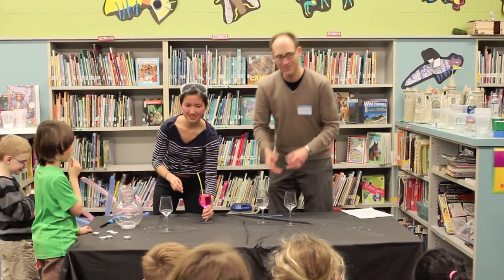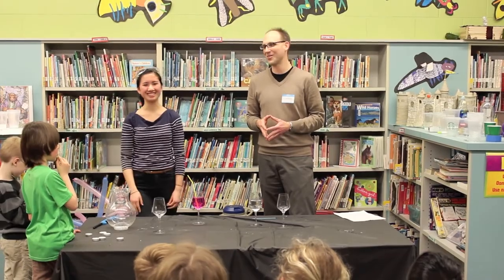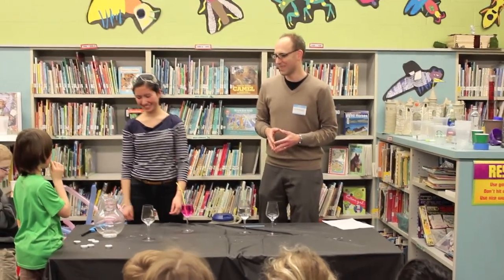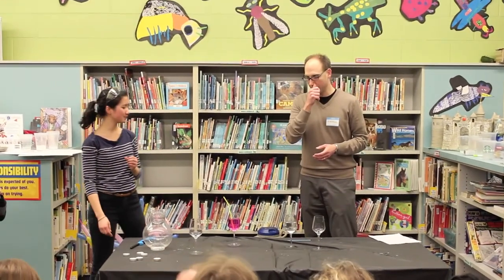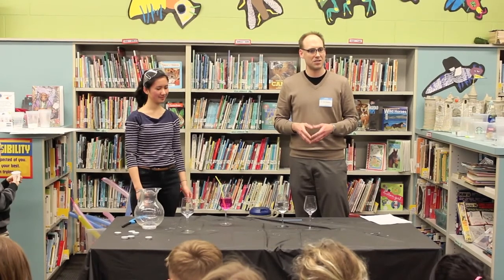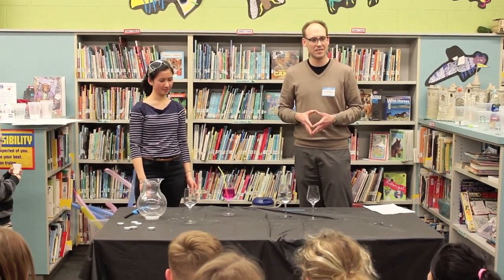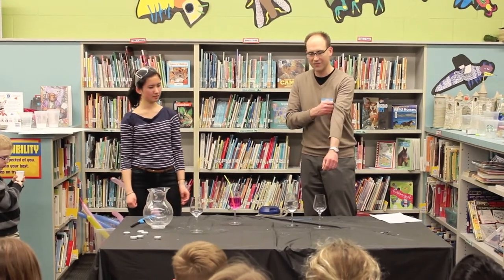Okay. Well, actually, what we did here, do you think the glass is really magic? We knew we couldn't trick you guys. We've got to back up on the blue line, please. Blue line, guys. So what we've done here is we've used a pH indicator called phenolphthalein, which in the presence of a base turns a different color, in this case a light violet.